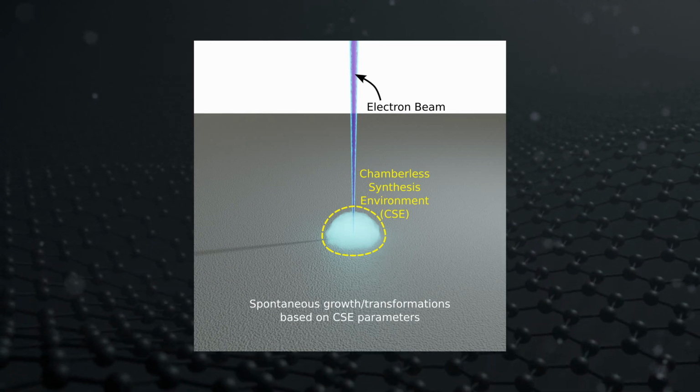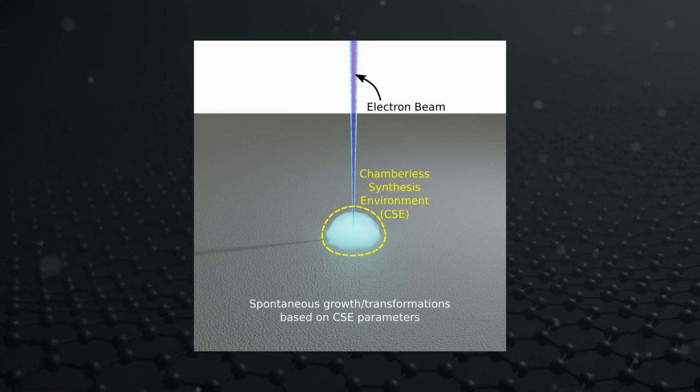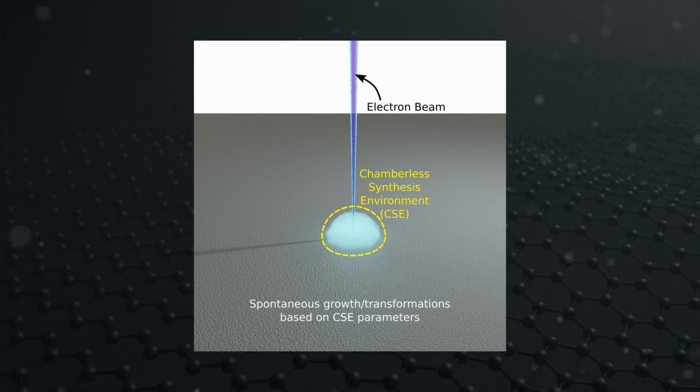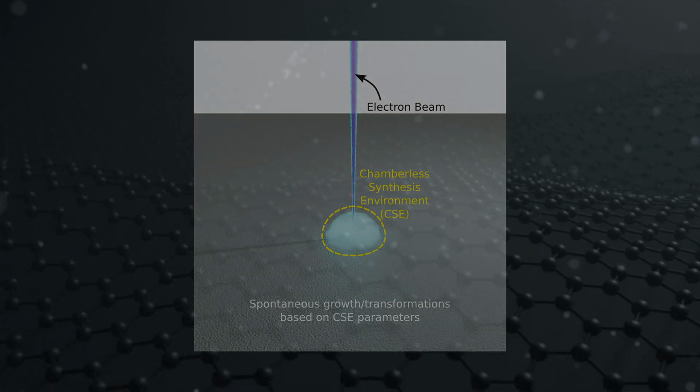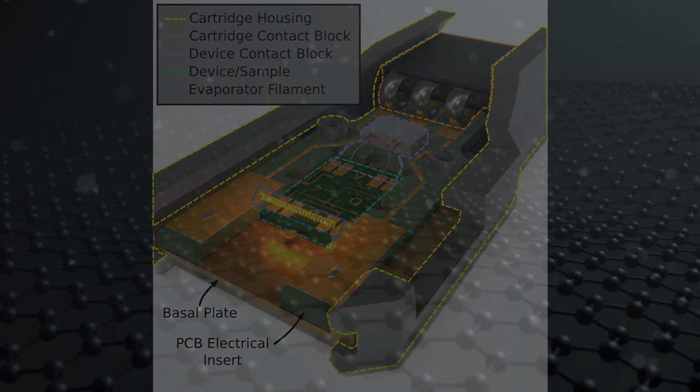One of the critical control parameters available for synthesis is the supply of a precursor material to the substrate of interest. This capability is generally not available in a STEM. Nevertheless, in that work we presented a simple way this could be accomplished using existing hardware that does not require modification of the microscope. In this work we present the initial testing of an in-situ evaporative delivery platform aimed at supplying atomized material to a substrate to enable the combination of synthesis and atomic fabrication techniques.